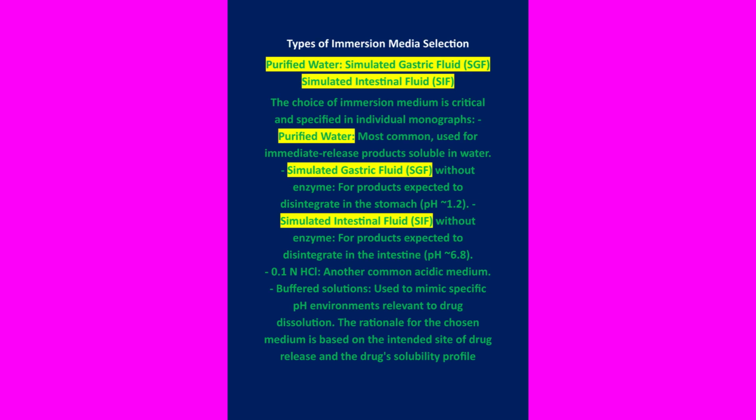Friends, here, what is the immersion fluid? How many types of immersion fluids are there? Please look into this. Usually purified water is the common immersion fluid, and simulated gastric fluid and simulated intestinal fluids. These are the immersion fluids in detail.